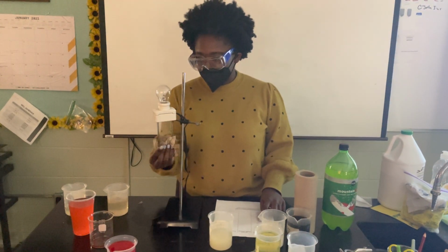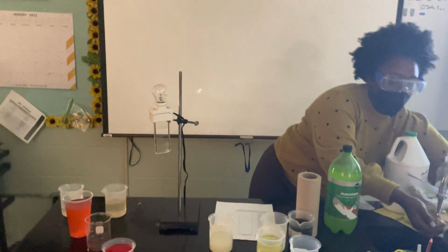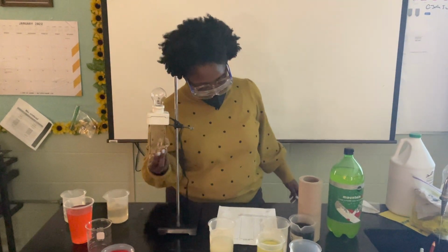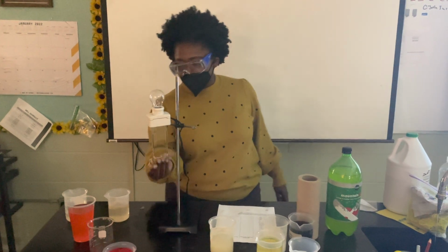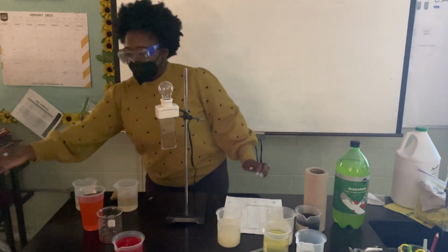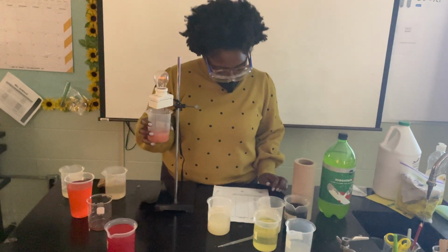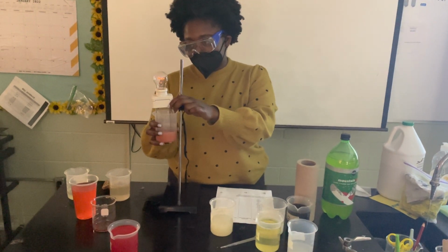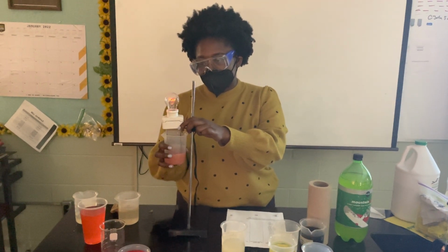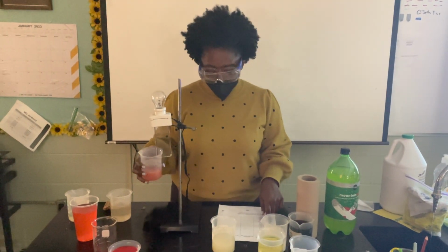we have grapefruit juice. I think I need to clean off these probes. Next, we have grapefruit juice. Grapefruit juice is pretty poor, but it's actually lighting, so we got to give it a fair. This would be fair. Fair. Next we have, oh, it smells bad.